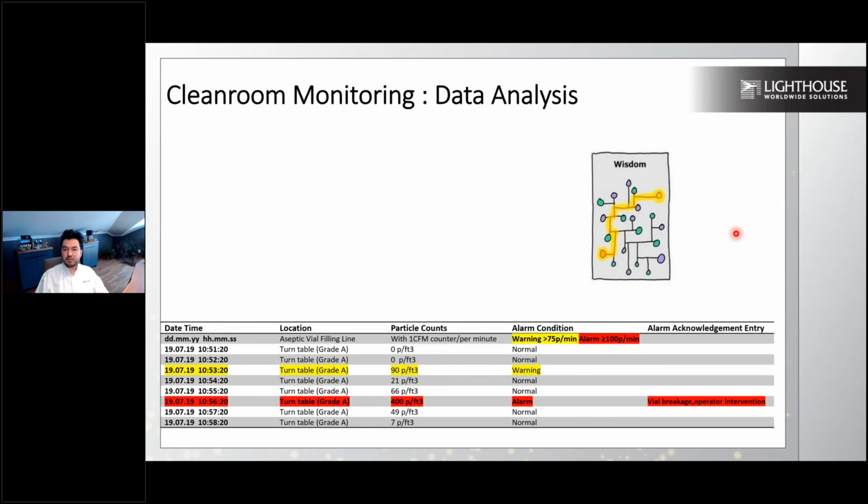There are other metrics, for example, microbiological activity in active and passive petries. So we will be verifying this information and we will be releasing our product without having any doubt after having these microbiological data. That's why seeing your data from day first all the way to the end is critical. From data to the wisdom is critical in order to see with the final recordings.